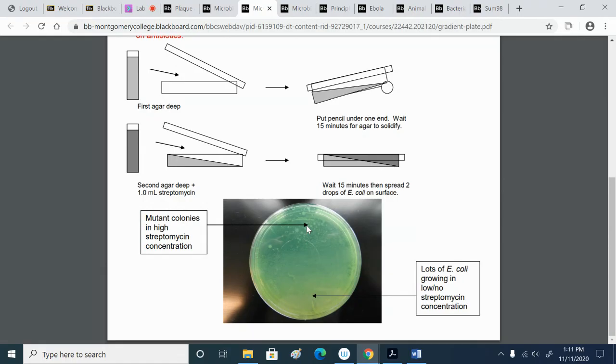And what do we see? We see some resistance there. Not a lot, right? Just a tiny fraction of 1% of all the cells on that plate, but there are some resistant bacteria present. Does everybody understand this picture here and what it's showing us?